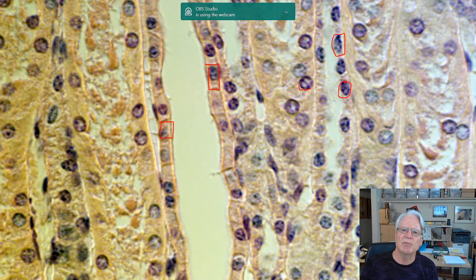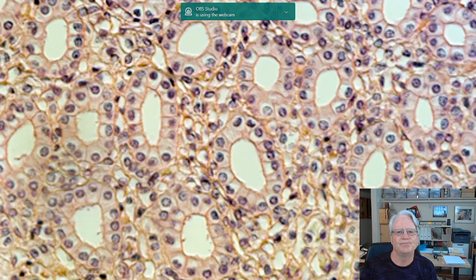This would also be, but we're not looking at it at the correct angle to really see the cell itself. But if you look over here, we can just barely make out that cell there, okay? So again, all of this is an example of simple cuboidal epithelium. Again, simple cuboidal epithelium here. Nice view of that, okay?